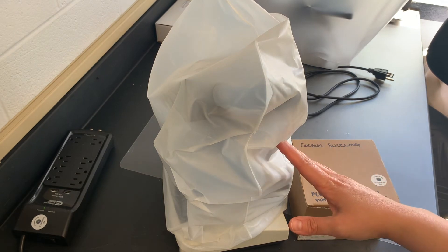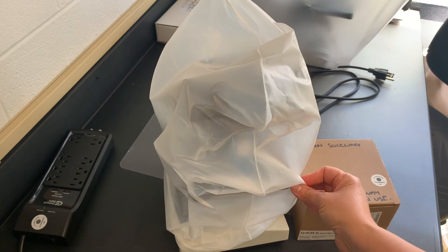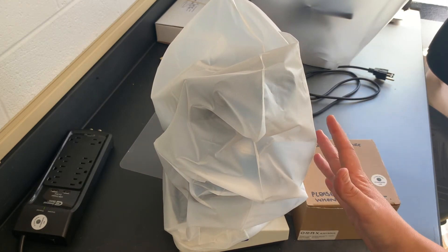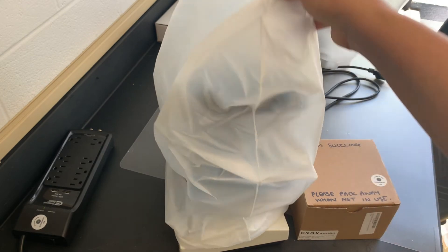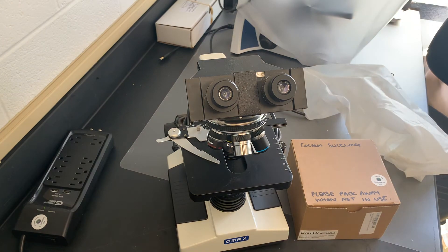Here we have our microscope. We've just got the cover on — we always want to keep the cover on to keep the dust off and keep the microscope in the best condition possible. Whenever you're not using it, make sure you have the cover back on.